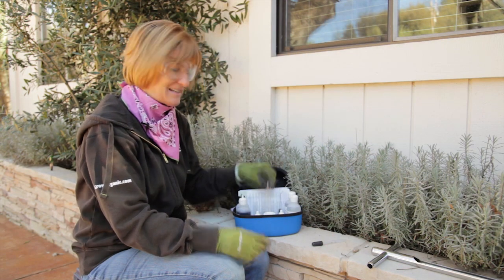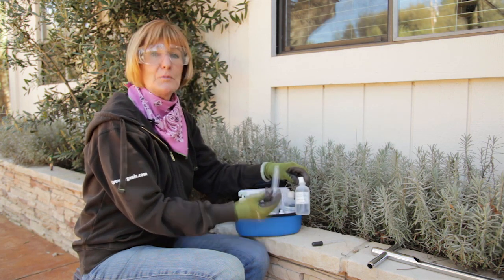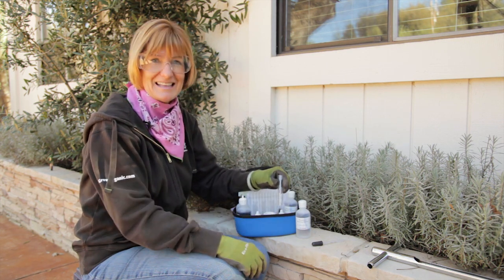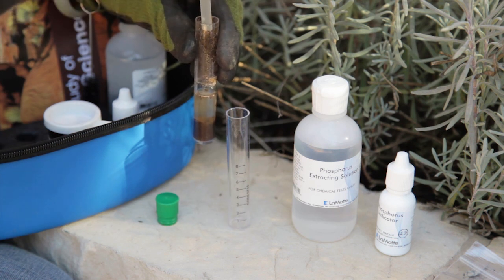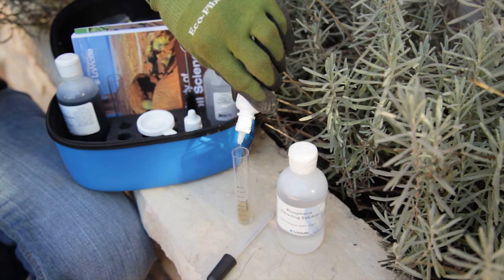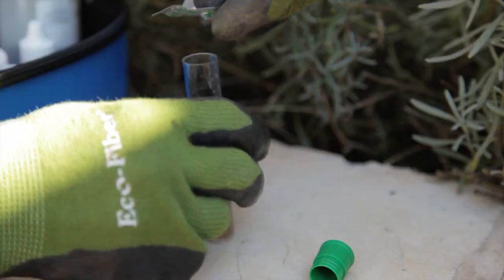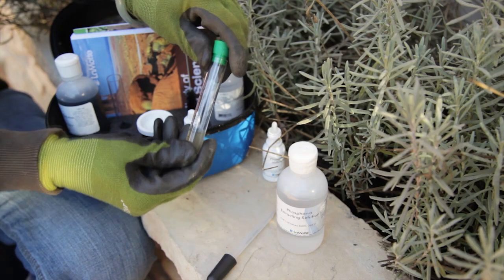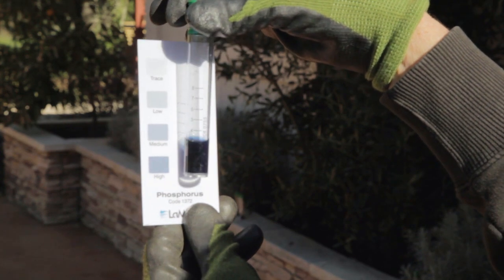On to the phosphorus test. Fill up the test tube to line 6 with the phosphorus extracting solution. Put in three scoops of 0.5 grams of soil, gently shake and let settle. Once it's settled, use a clean pipette to move the clear liquid to another clean test tube to line 3. Add six drops of phosphorus indicator reagent. Cap and mix. Then add one phosphorus tablet. Be careful not to touch the tablet. Mix until the tablet dissolves and the liquid turns blue. Looks like I have plenty of phosphorus.